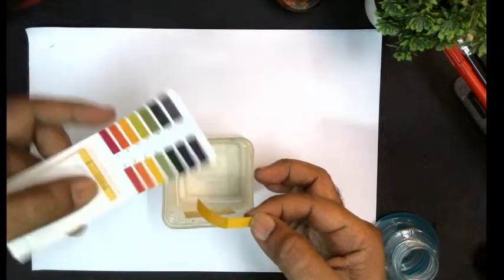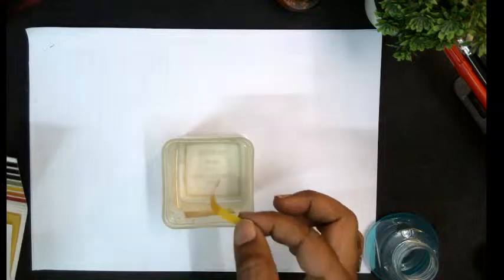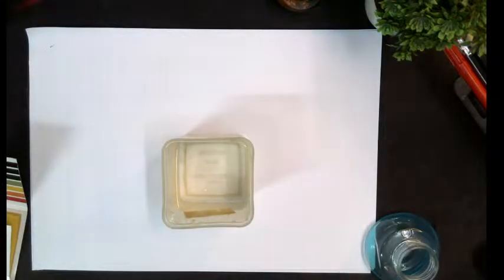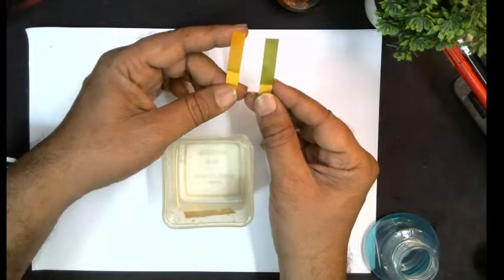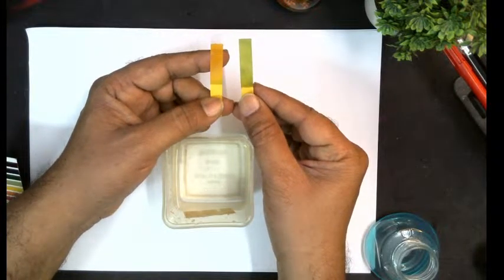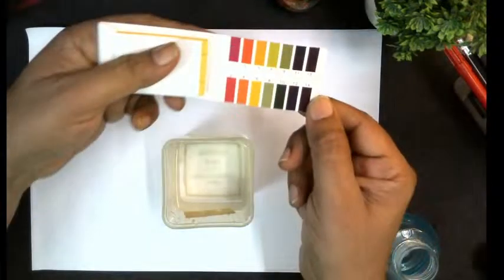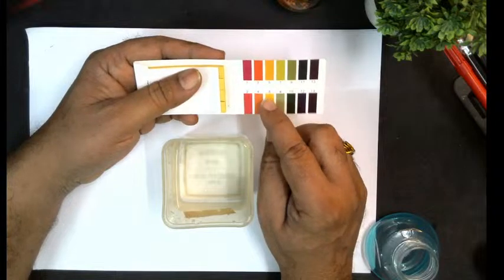Are you able to follow? This is 6, right? Okay. So since the lemon is a weakly acidic one, that is citric acid, let me show both. This is pH 7, this is pH 6. Are you able to find out the difference between these two? Okay, right. And now it is indicated in the strip as this is 6 and this is 7.